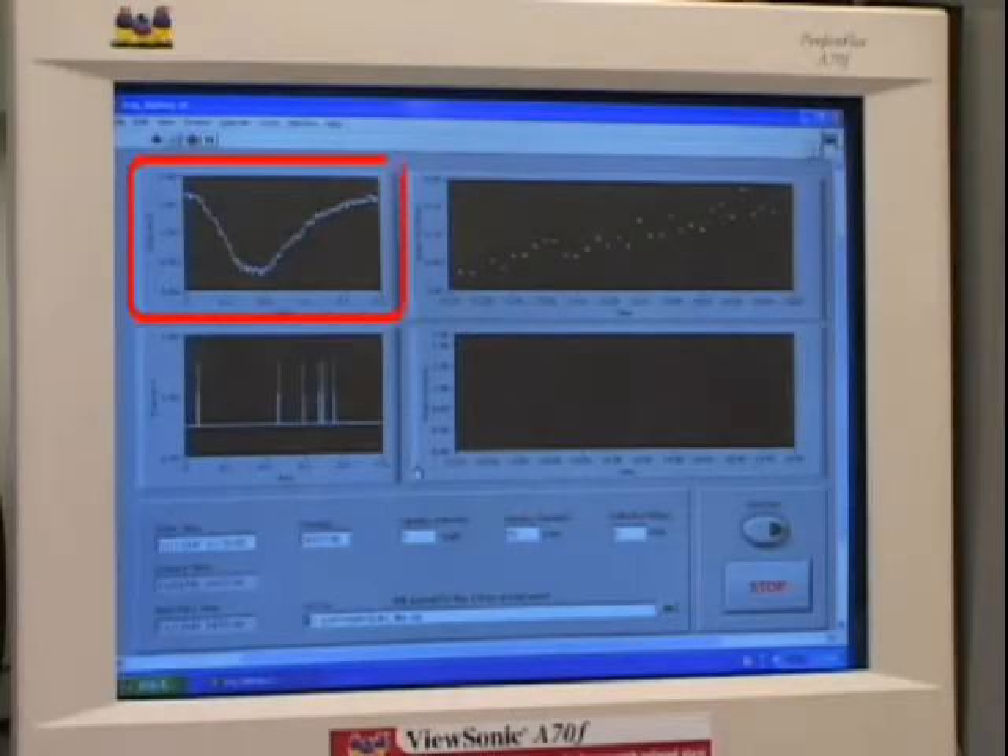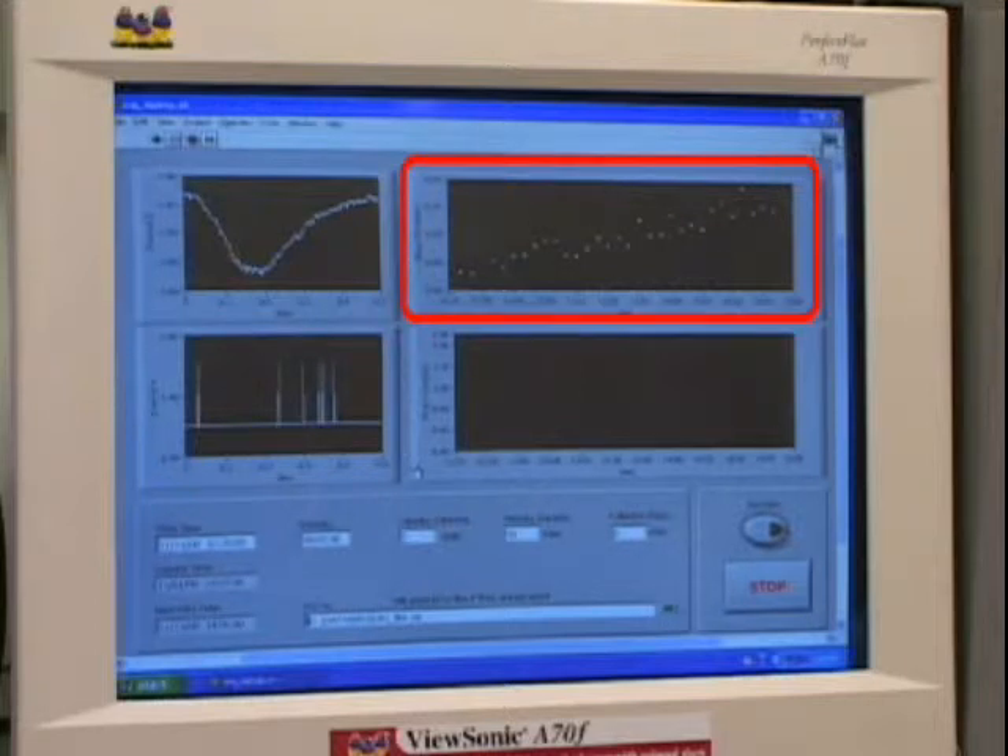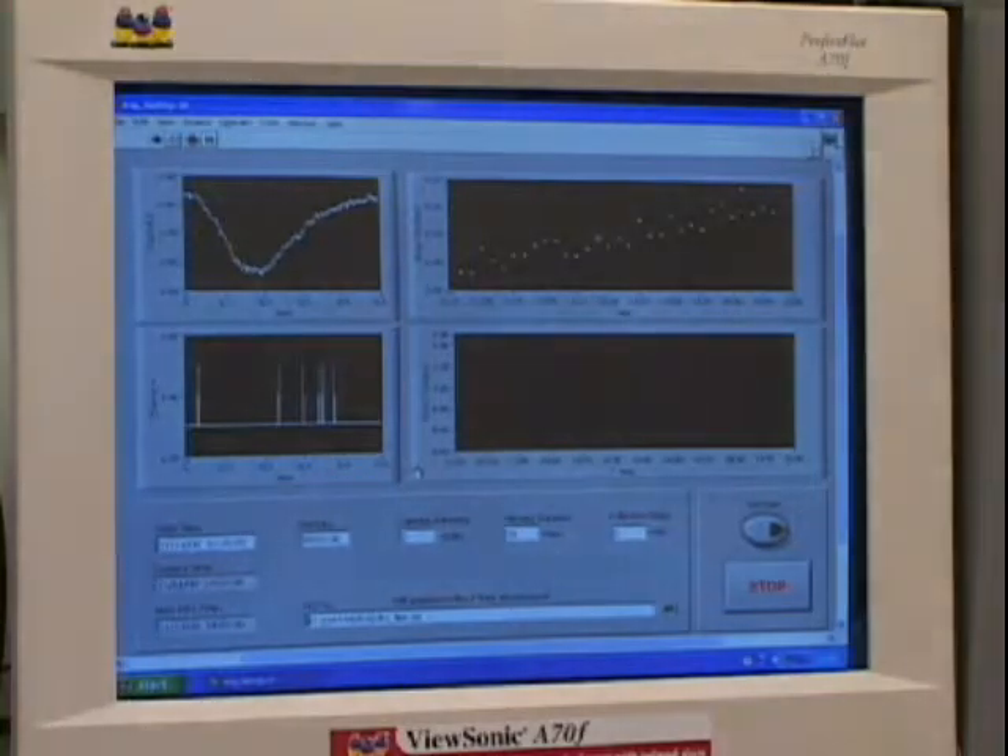On the left is displayed the ERG waveform to each light flash, and on the right is plotted the peak-to-peak amplitude of successive flash waveforms for tracking changes in eye sensitivity over time. With ERG recordings, one can study the effects of light adaptation and circadian neural modulation.